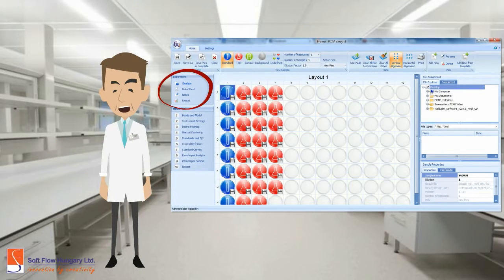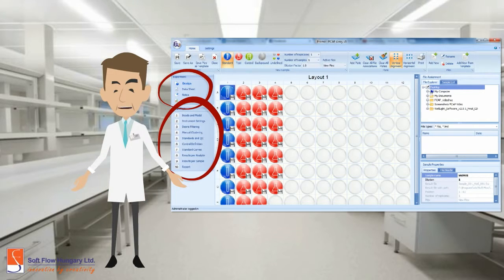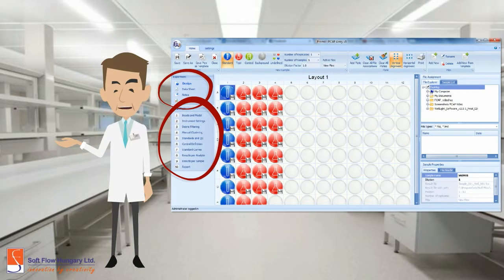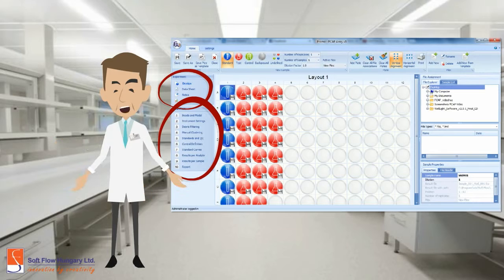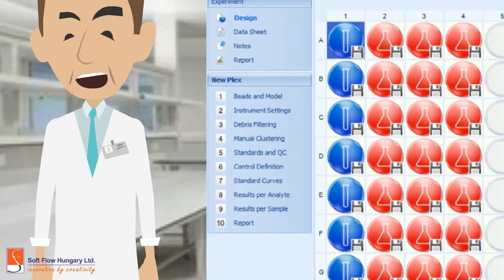The section right below is the newplex. You are going to navigate through this block to change data, organize it and visualize in the most different ways. Modify and analyze.